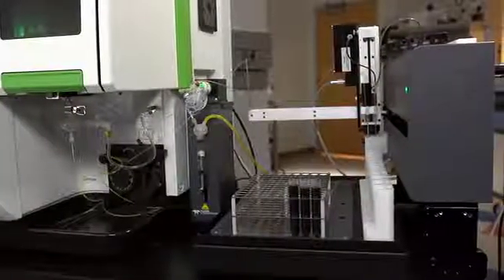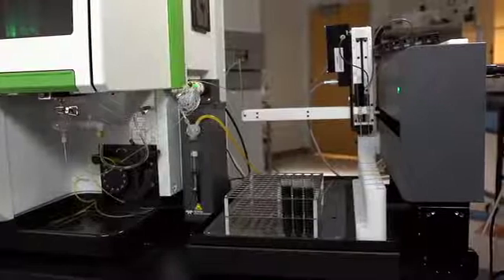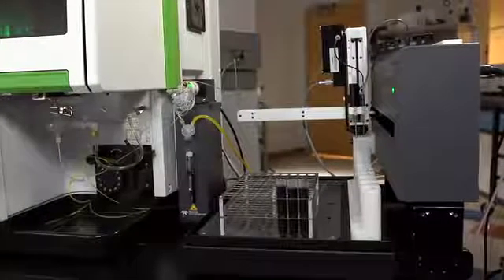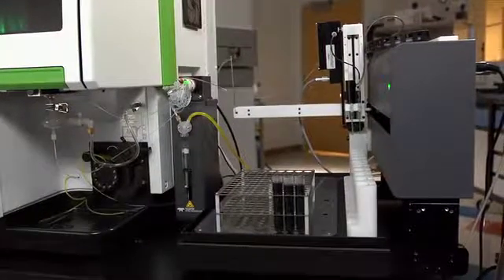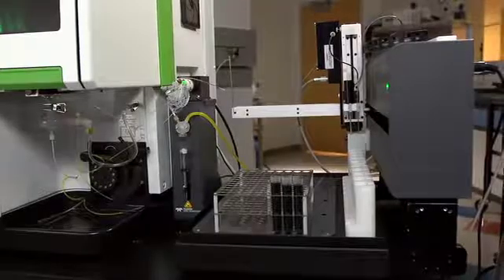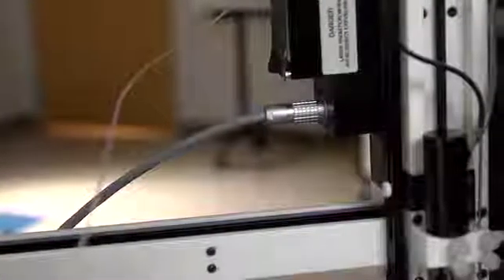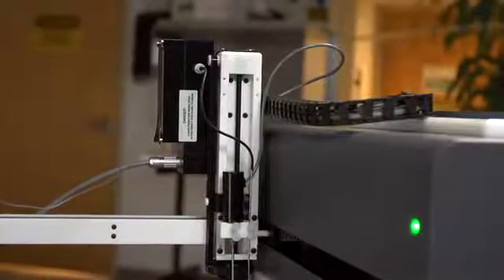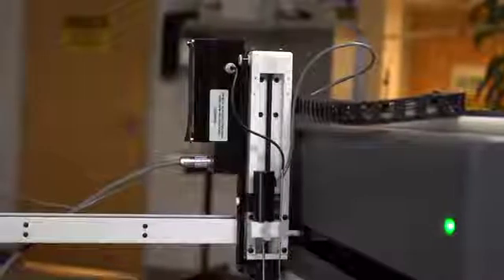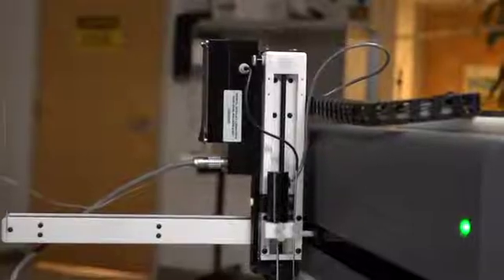As shown here, the LPC 500 liquid particle counter is an accessory with the optical sensor mounted on the auto sampler arm linked to the multi-channel pulse analyzer or MPA via push-pull circular connector cable. The MPA is used to convert the volts output by the detector in the sensor to particle counts and sizes.